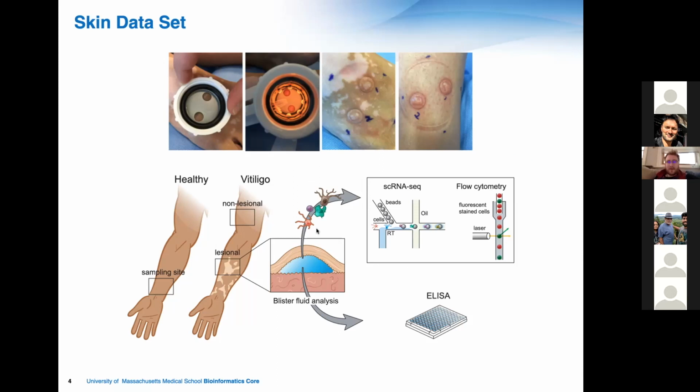And one of the biggest things that can be, I don't want to call it a learning curve, but kind of having the confidence to take in single cell data and to analyze it and process it and annotate it with all the cell types that you think are there, there's not 100% right or wrong way to do this. And in some ways, it is a little bit subjective.